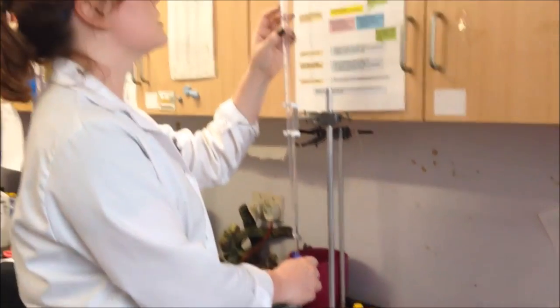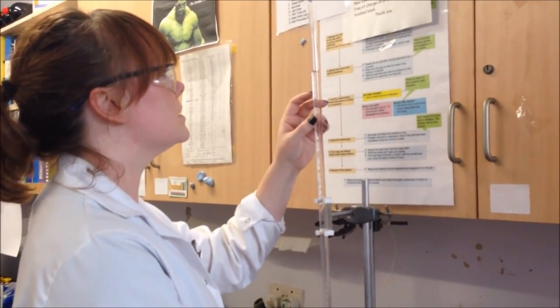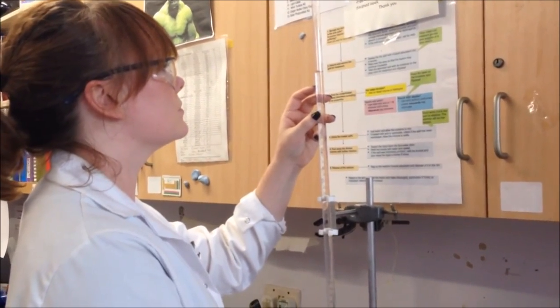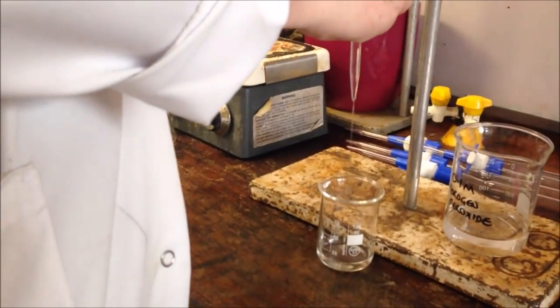Watching carefully, when I get close to the end point, I'm going to slow it down a little bit, and then go drop by drop. So I'm close to the end point, I've slowed it down, and that's my 10cm³, so I'm going to stop there. I'm going to move this to the end next to my timer, because that's where we're going to need it.